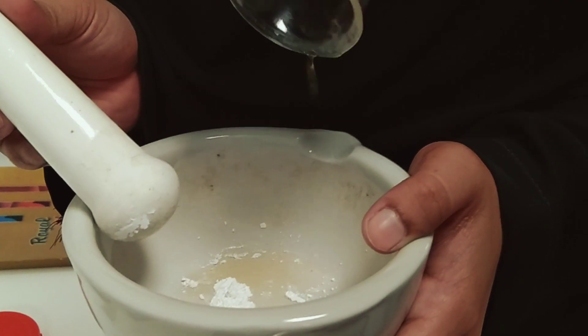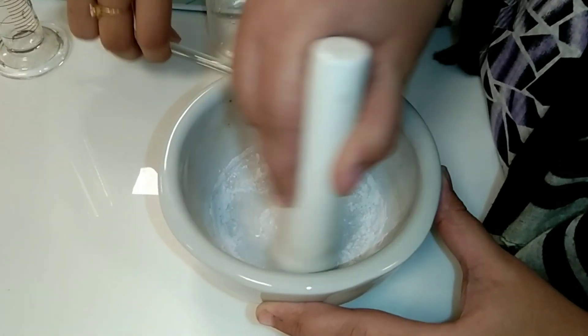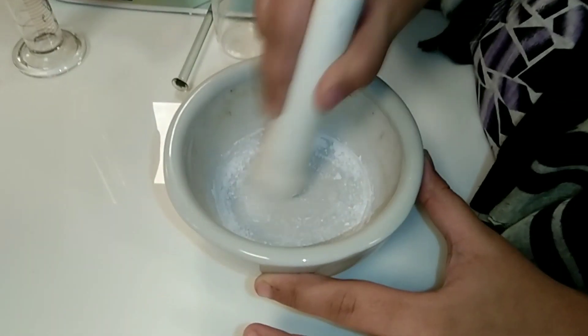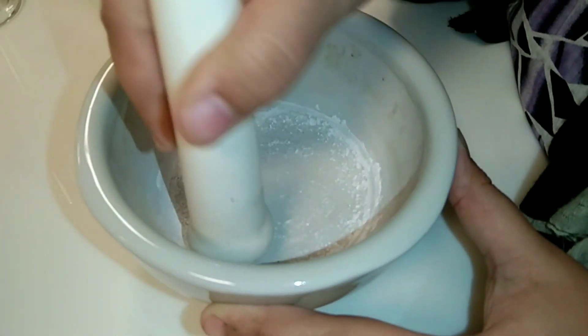Now we will triturate talc with the tincture and the citric acid—all three ingredients—and we will gradually add 8 ml of purified water into it.